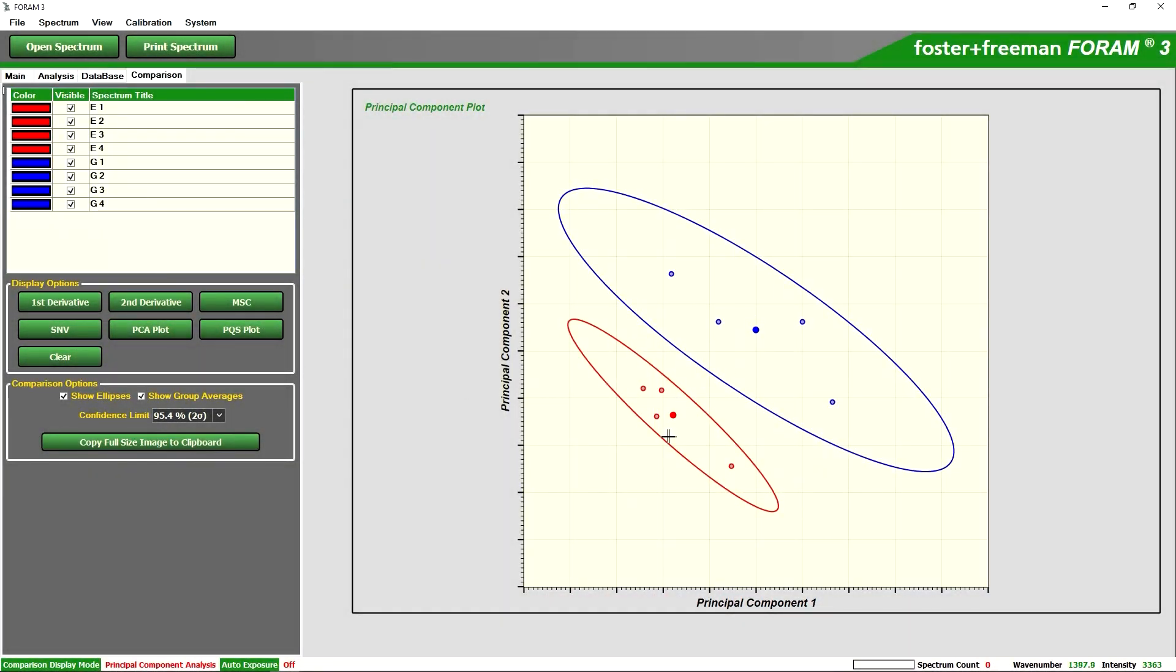Here we can see this time that with our principal component analysis the two ellipses are apart from each other and this would indicate that statistically the two spectra are different.